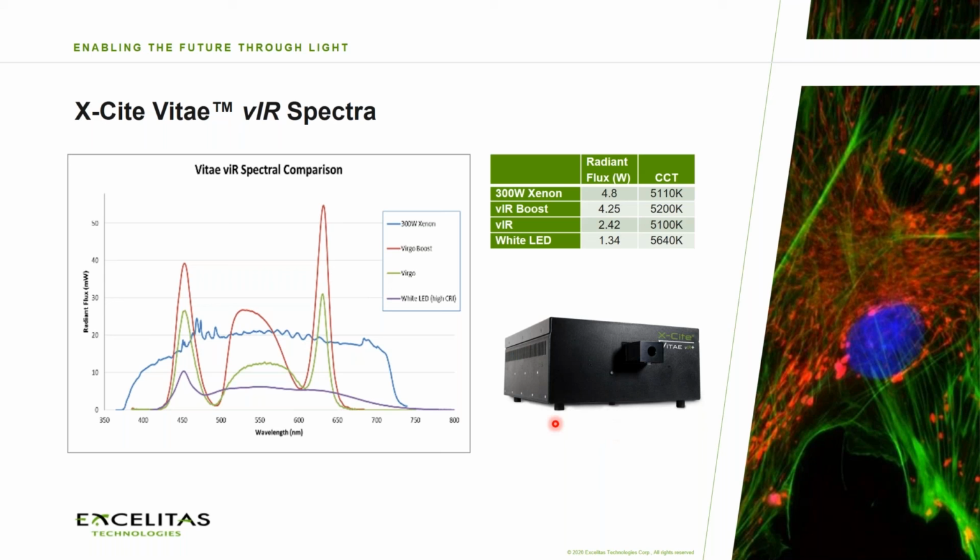So just to summarize, LEDs no longer basically have to suffer from the gap. The green gap did exist between 500 and 600 nanometers, and it was a massive challenge for a lot of companies and a lot of industries.